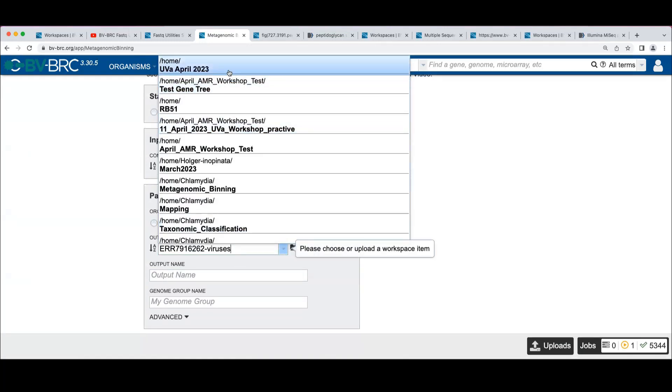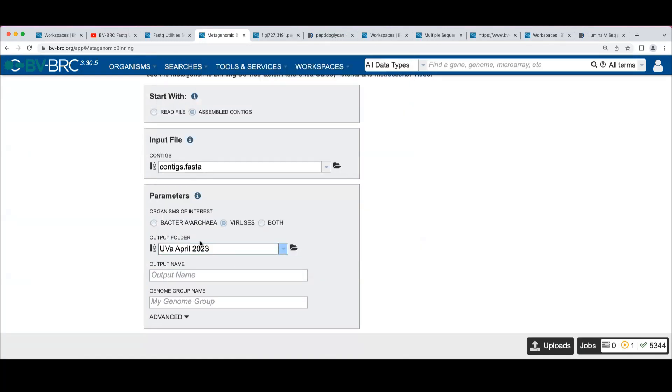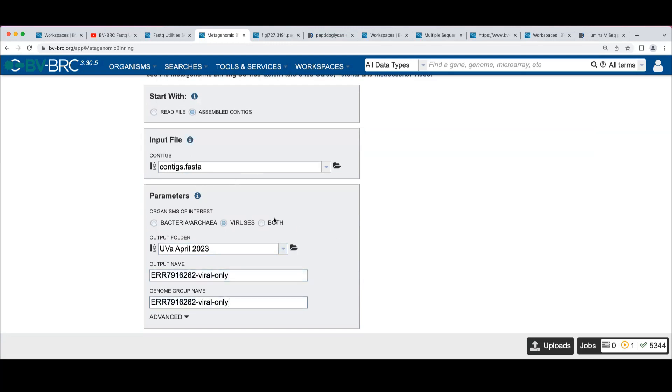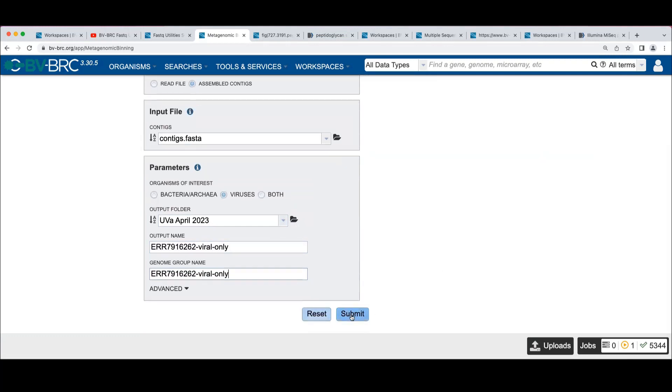Now let's say I just want to look at viruses. I want to go over here.